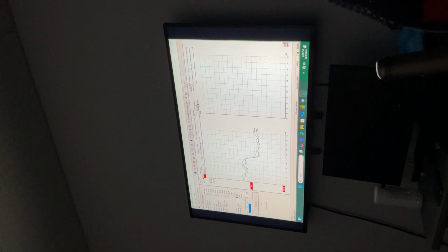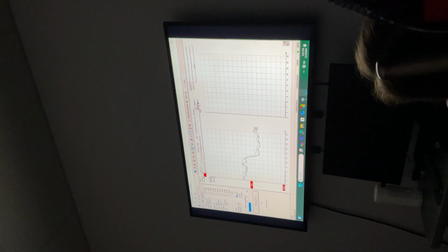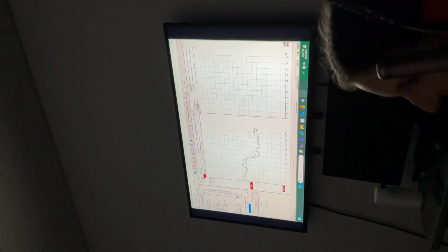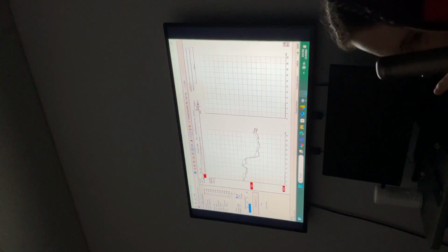It was like, oh, it's not moving, but then I realized he hit stop. So 6.5. Well, that's not it. But why would, you could hear the sound? Is it because it's on 39.1? Oh, okay. So, yeah, that's the rate. Oh, I changed to 19.6. You might be on something. It's 19.6 instead of whatever you said. 37.7. I think it's different.